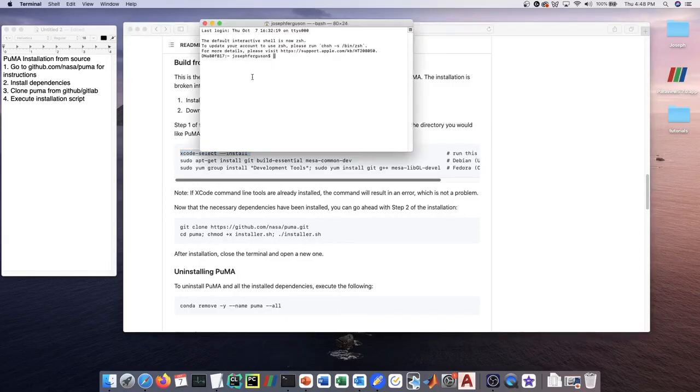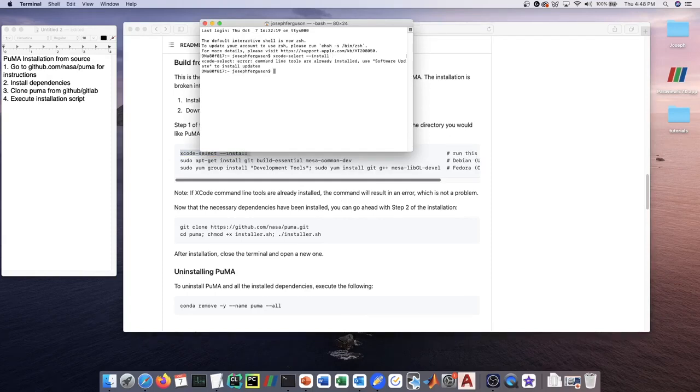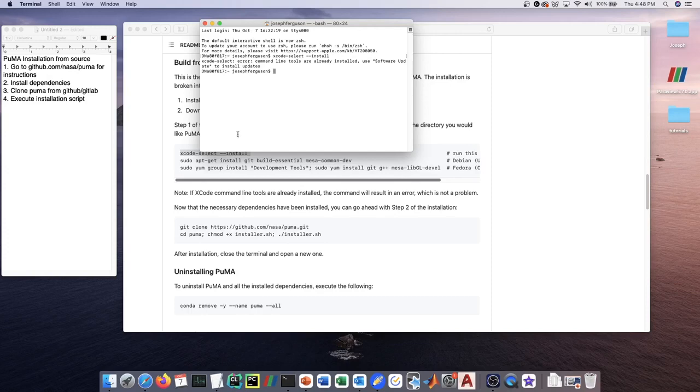In this case, it's installing the Mac Xcode command line tools. I type that in and it says error: command line tools already installed. If you don't have the command line tools, it's going to take you through a bunch of prompts in order to install them.